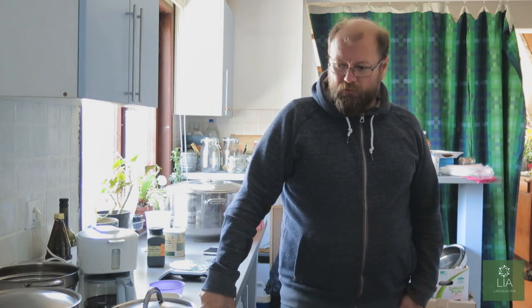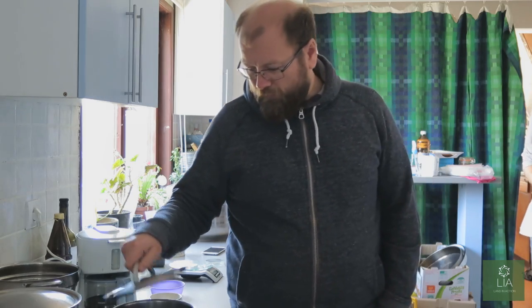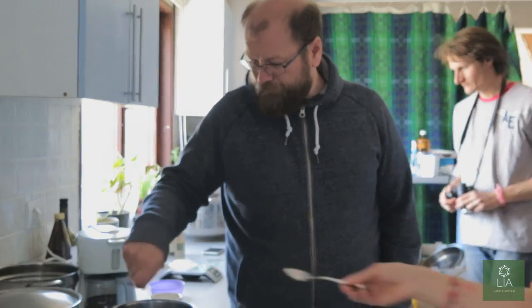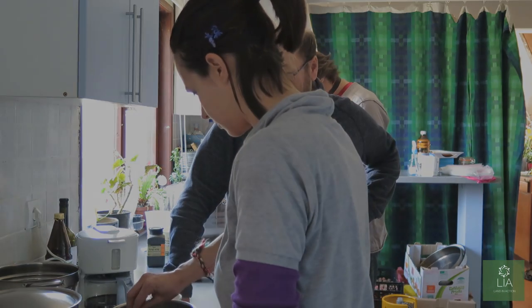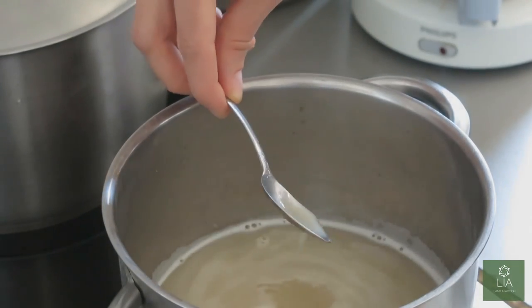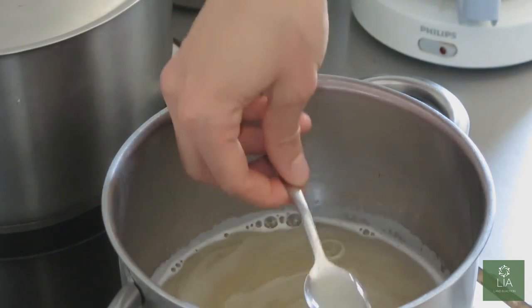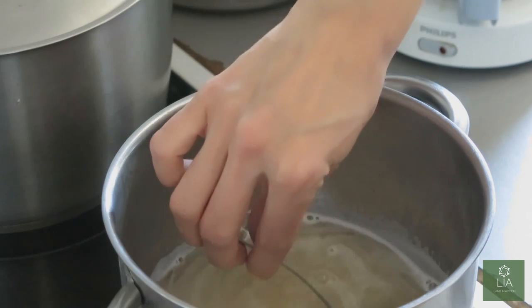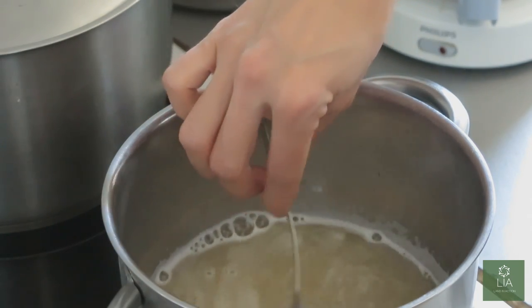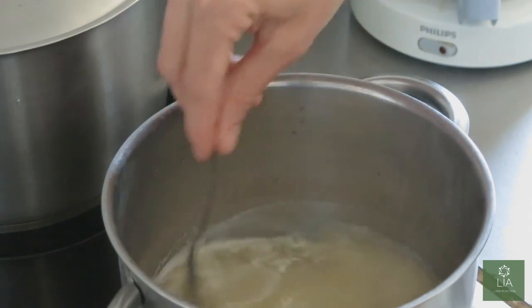So we just want to heat it, dissolve everything into the water, and then we can transfer it. There are just small particles of these. So we're going to switch this off before it comes to the boil. We're just going to get everything dissolved, and then we'll transfer that to a jar. We'll put it in the pressure cooker.